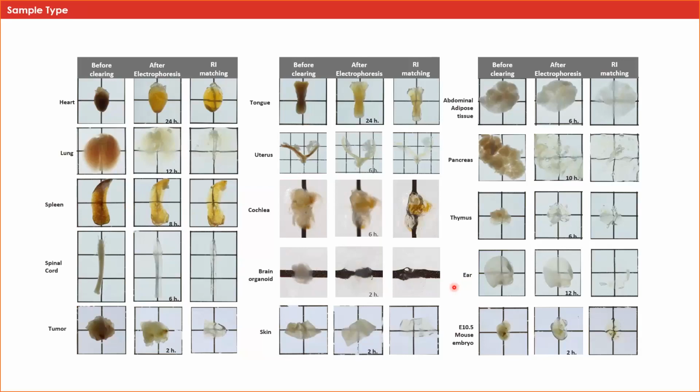Certainly, some tissue types are more recalcitrant to being made optically transparent than others. The older, more pigmented, fibrotic, or fatty a tissue is, the more difficult it will be to clear. You can still use tissue clearing with these samples to image depths significantly greater than non-cleared tissue, but you will need to determine the optimal sizes that can be cleared.